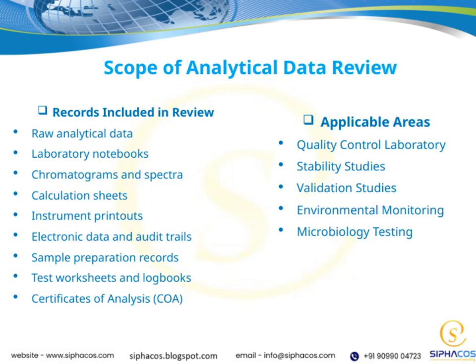Instrument printouts are checked to verify instrument performance, and electronic data and audit trails ensure data integrity and traceability. Additionally, sample preparation records and test worksheets or logbooks provide context for the testing procedures. Certificates of analysis, or COAs, are the final documents that summarize the testing outcomes.